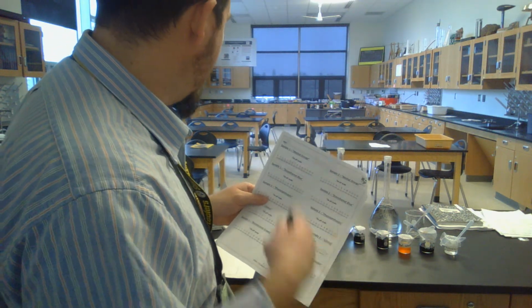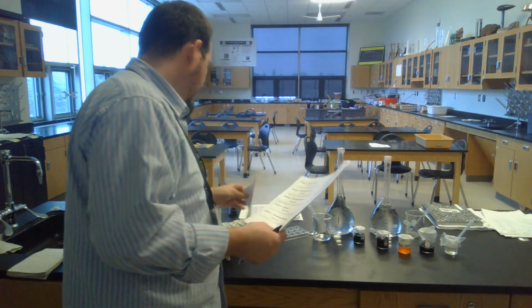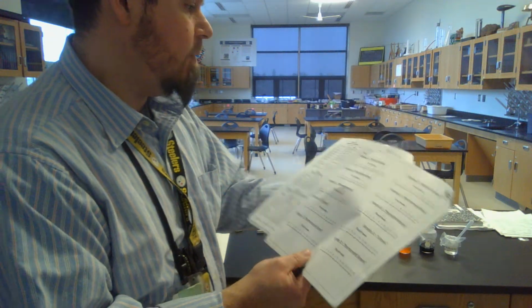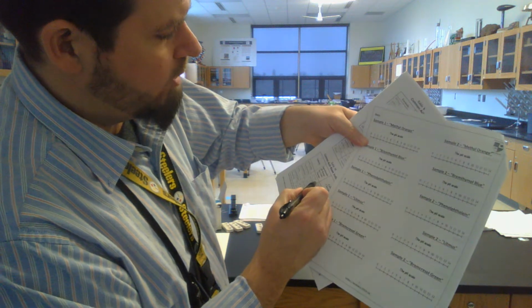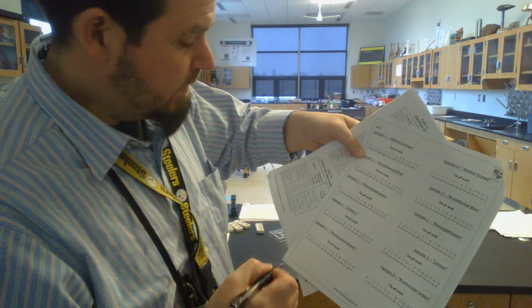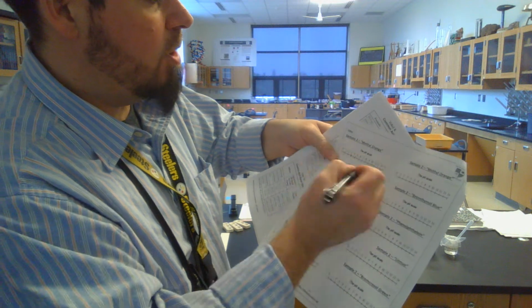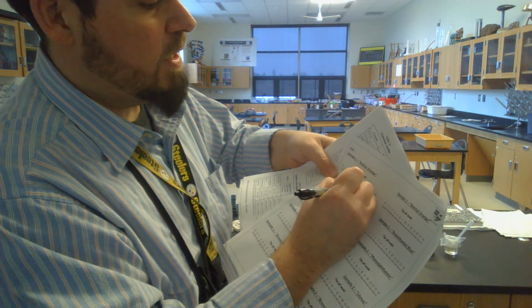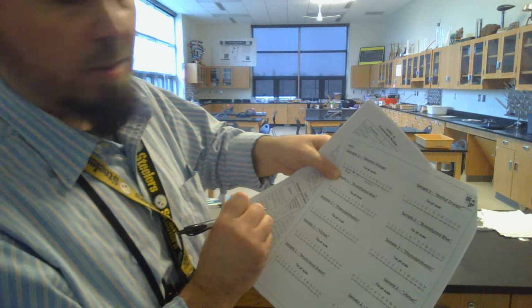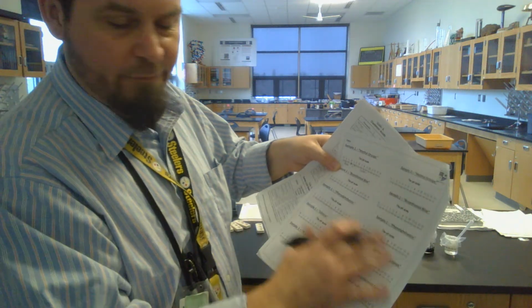And before you start the lab, this is what I want you to do. I want you to go to table M in your reference table, okay? And I want you to say on methyl orange here, I want you to get the range down. So it says 3.1 to 4.4. So I want you to make a good mark at 3.1, and I want you to make a good mark at 4.4, okay? And then it says from red to yellow. So you know on the left-hand side it's red, and on the right-hand side it's yellow, right? And in the middle would be orange, and there's not a lot of room, so I'm going to put an O. Okay? I want you to do that for every one of these.